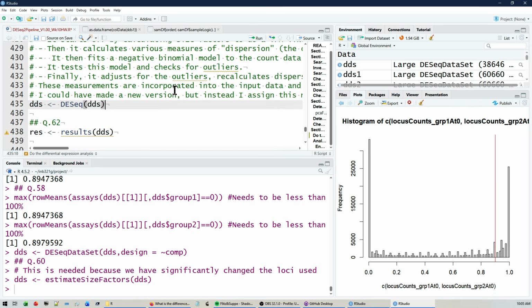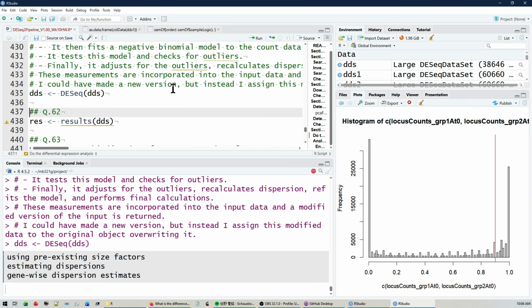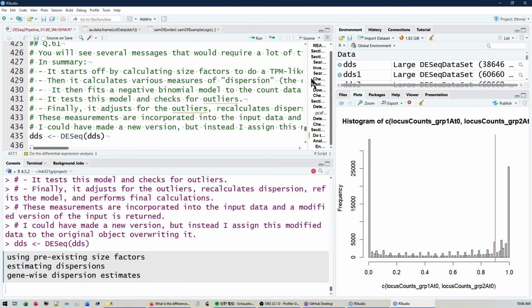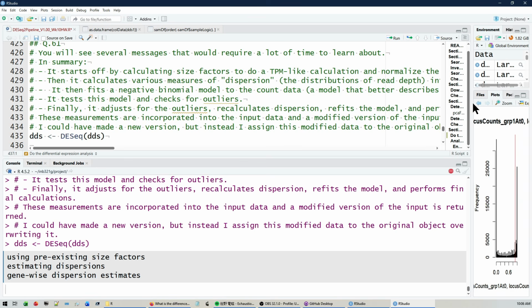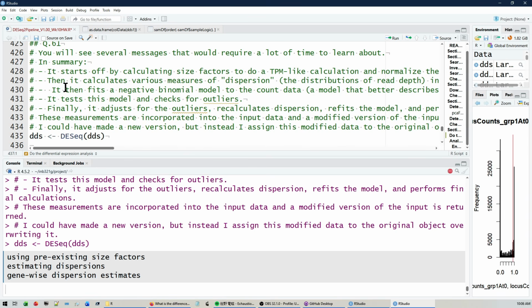And here it is. Here's the differential expression analysis. So far, all we have done is prepare and filter and reorganize the data. But now is the differential expression analysis, and it's going to be a single line of code. Oh, there it is. There's not even a second argument. It's just DDS as an object. One of my favorite little quirks of this field is that that's often true, that most of my job is ultimately getting the data in the right shape for someone else to have gone through and built a whole package.